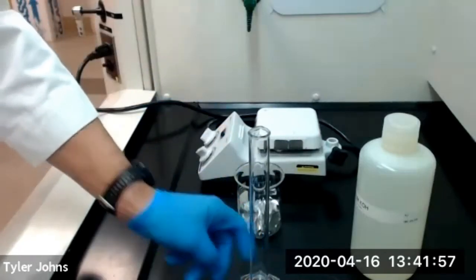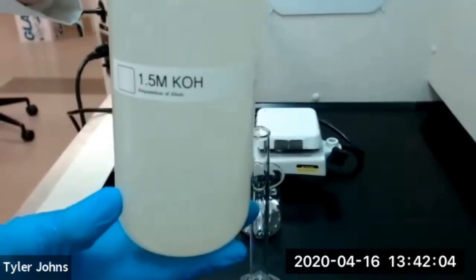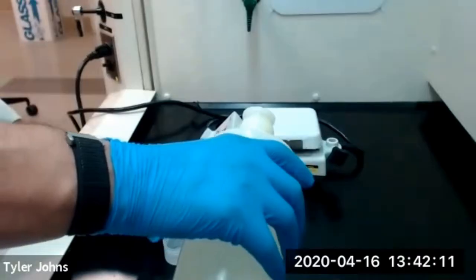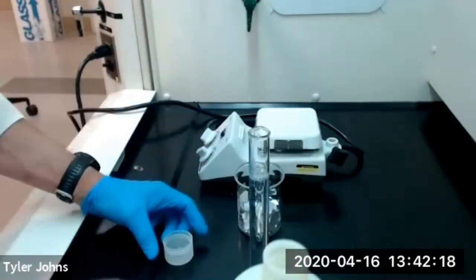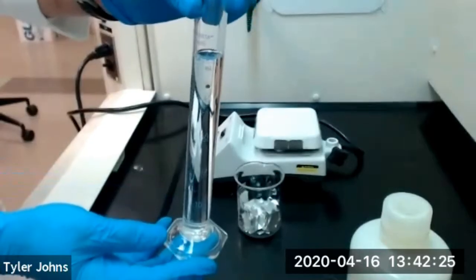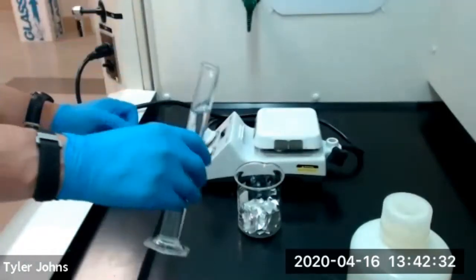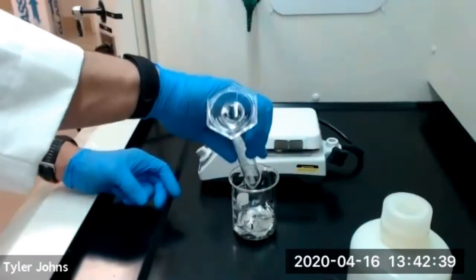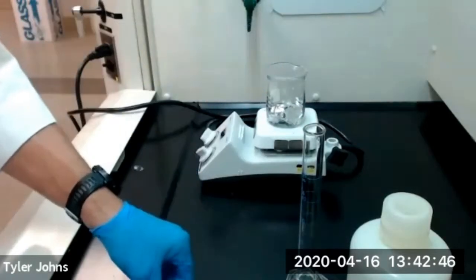So what we're going to do next is we're going to add 50 milliliters of 1.5 molar potassium hydroxide to dissolve our aluminum foil. So we have our 50 milliliters of 1.5 molar potassium hydroxide. We'll add this to the aluminum foil. And then we'll heat gently on a hot plate with a glass stir rod in.